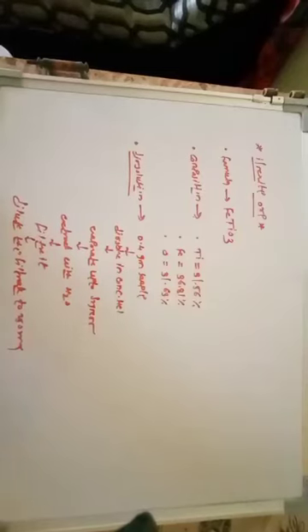Morning, dear student. In today's lecture, we will discuss the next important practical of our course CHR 334 section first, that is determination of Fe and titanium from this ilmenite ore.